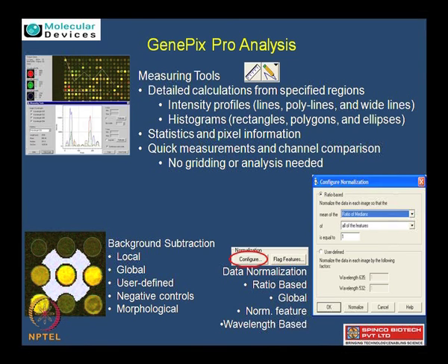Say for example, you have a positive control, you have a normal control, you have also got a shape control, morphologically different ones. So you calculate them as features and configure the software to choose which one to go for. You also have a negative control which gives only the negative background in the same area of defined other types. I guess we discussed the need for these controls, right?